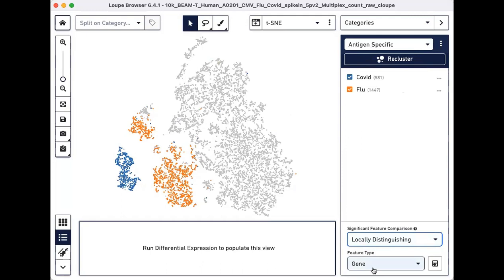Leave feature type as gene. This is the default. Then click the Calculate button next to this drop-down menu.